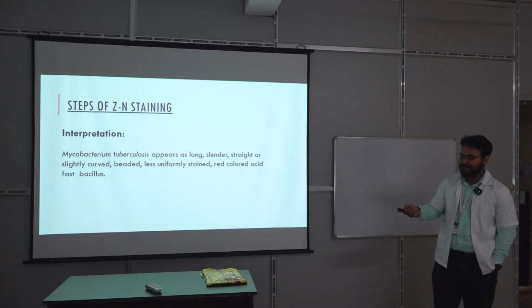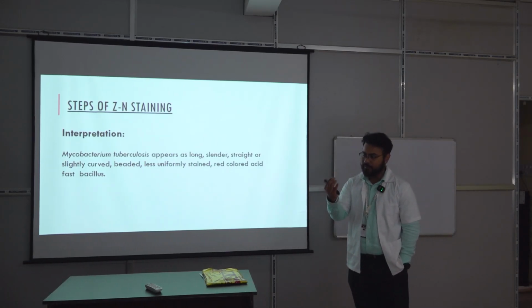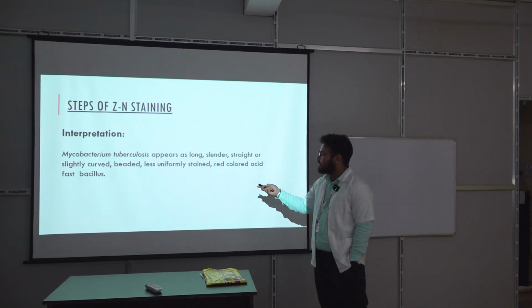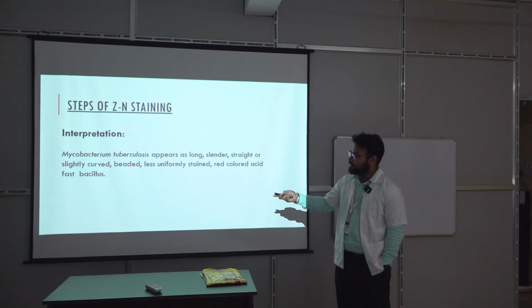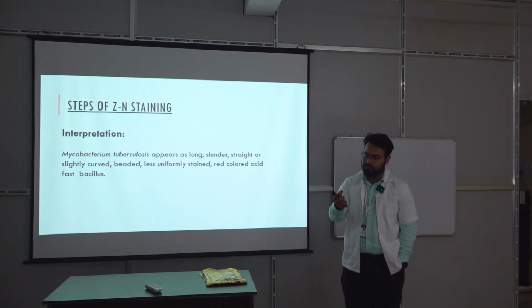Not easy? Acha. So you can just look at the slide, you can just look at the bacilli and you can identify all of these features. Long, slender, straight or slightly curved, very easy. Okay. Beaded, you will understand when you focus it, okay. Why is it beaded?